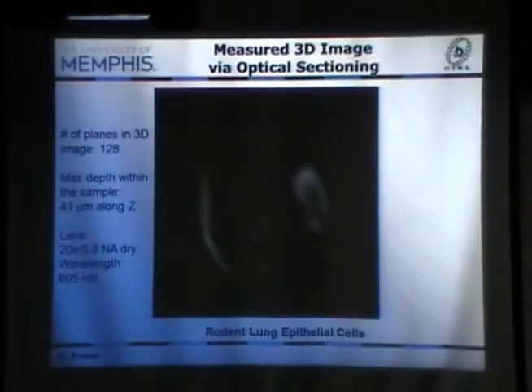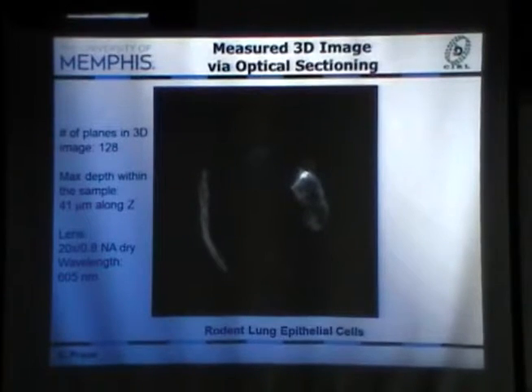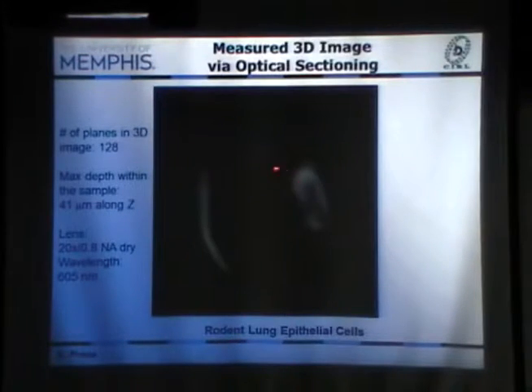So here's the movie which we played earlier. If you're collecting this sequence with the microscope, you will observe that. The projector is very dark, so there's a lot of brightness adjustment here, but you can see a cell of different shape on top of another cell. Let me try this again. Here's the cell, and as you focus, it gets more focused, and then there's a smaller structure that comes into focus.